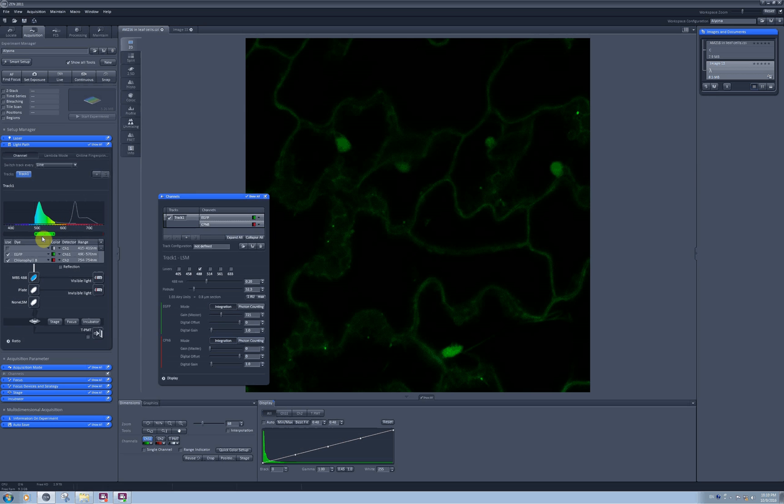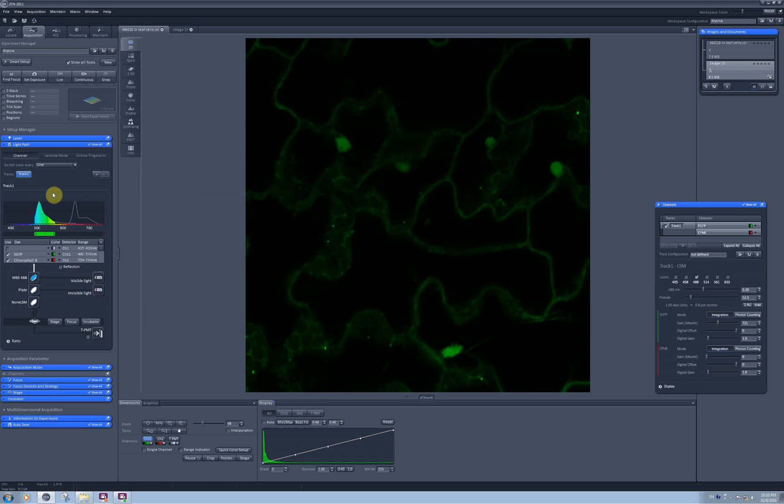And to be able to unmix chlorophyll from GFP you need to have spectra for them. To obtain a spectrum for chlorophyll I will scan a leaf of wild type Arabidopsis plant.